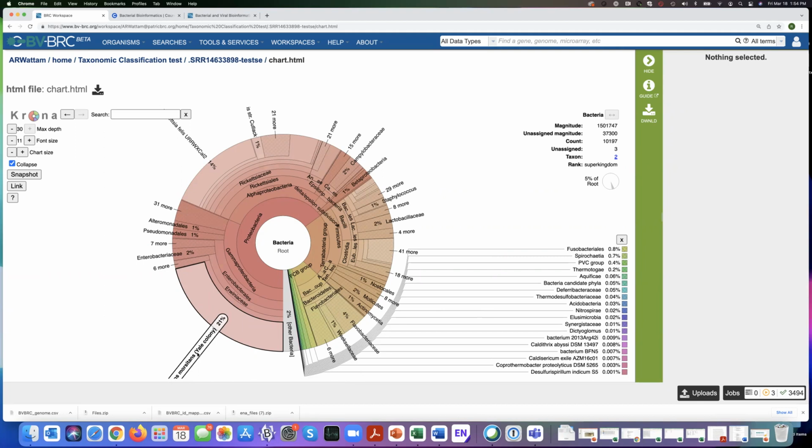What I've been trying desperately to do is get those bacteria I'm interested in out of this, but this could be something new, right? So I don't want to restrict myself to an individual genome. I would like to restrict it to the known space of genomes for that organism and draw those out. Right now, this file is too big because it's got all of that tsetse fly junk in there and I can't get it out. But I've been playing with this for a while, trying to get what I want from it.